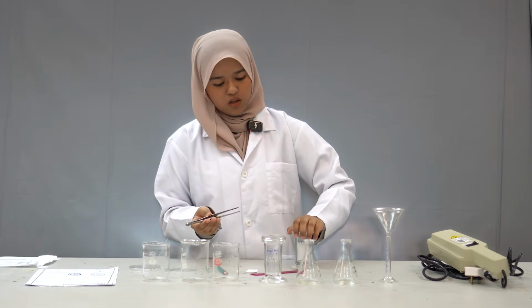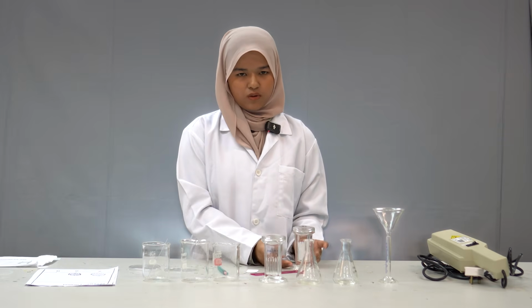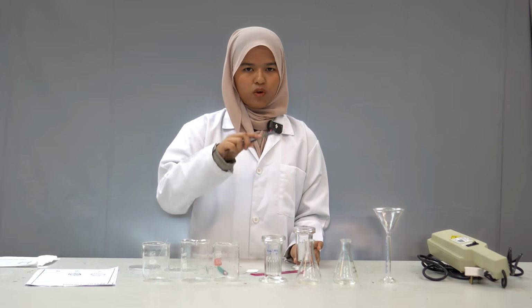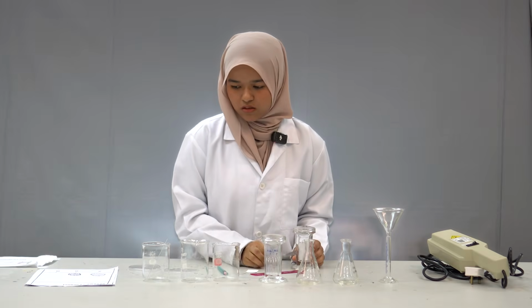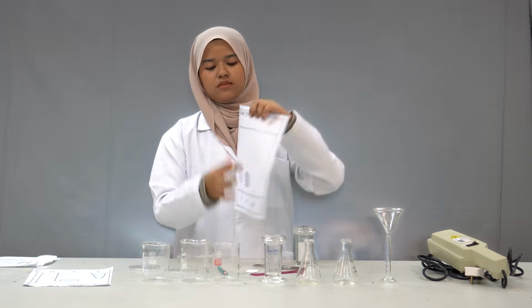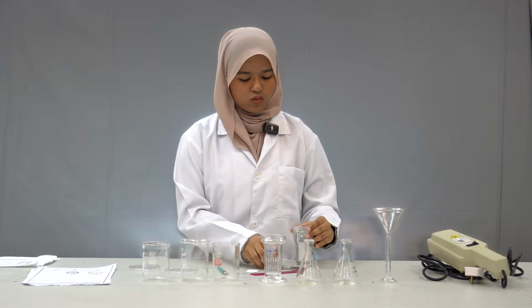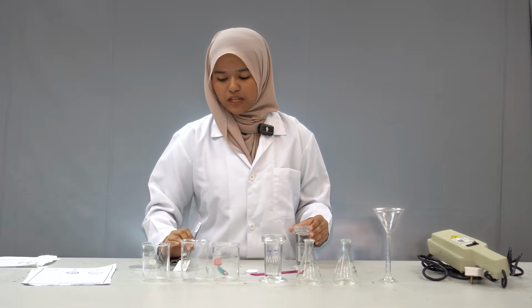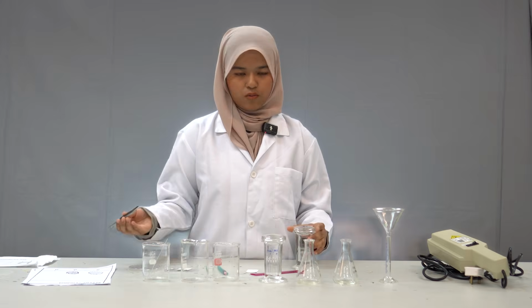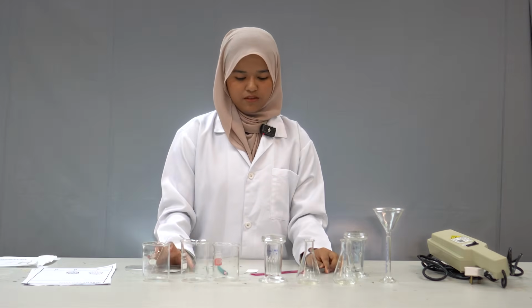Then you need to let the solvents inside move up until the solvent front, up until here. Then after that, you need to take out the TLC plate, and then let it dry for a while. And that's it for our procedure.